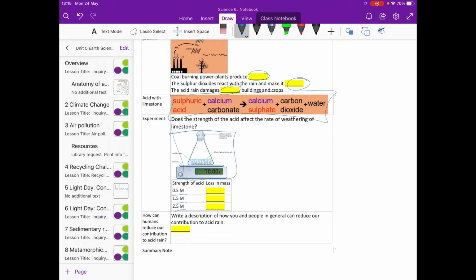So now you should first off think, before you do it, the mass is going to go down because we know carbon dioxide is going to be released, but which one will drop down by the most, do you think, and which one will drop down by the least? What do you think? Once you've finished thinking, pause the video now, have a think. Okay, and then hopefully the video will cut nice and smoothly into the video I took earlier in 2 parts, because I forgot that I had to give up my room, where we see this reaction taking place.